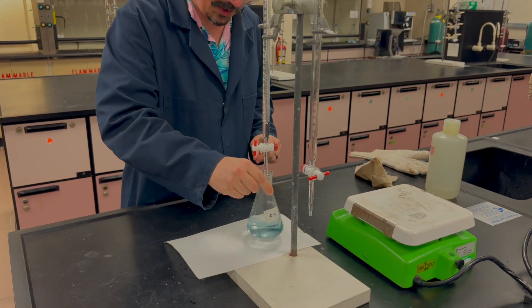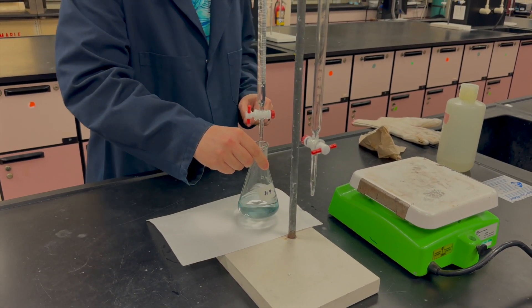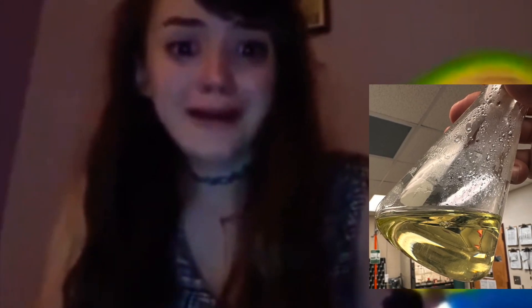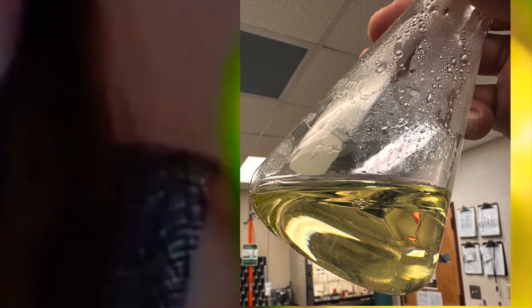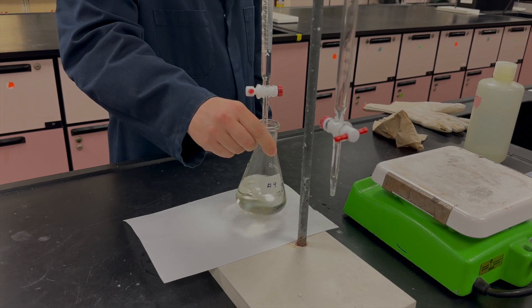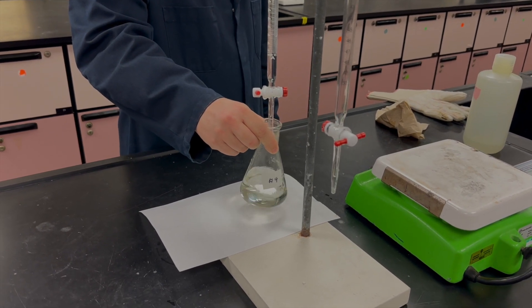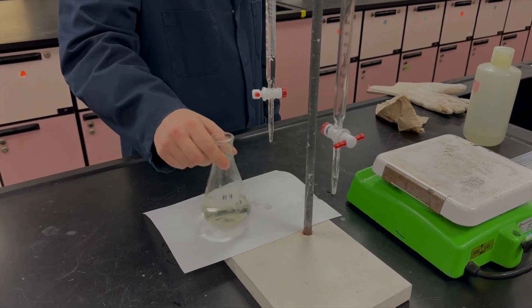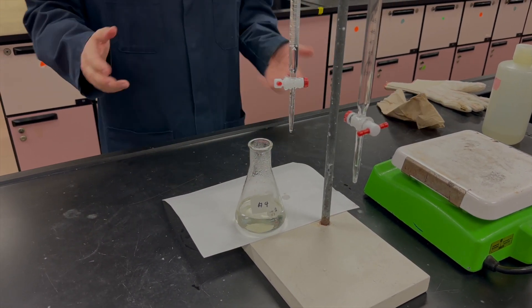We're going to resume that titration, and more than likely we're going to see that yellow color come pretty rapidly. Even though you may be using 10 or 20 milliliters to get to the point right before this, it's probably only going to be four or five drops to get that final yellow color that you're looking for.